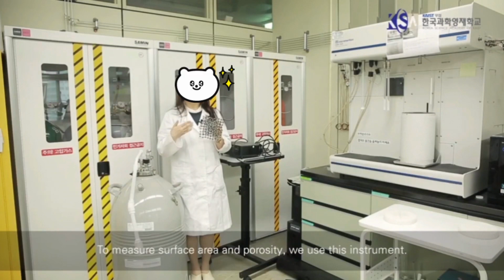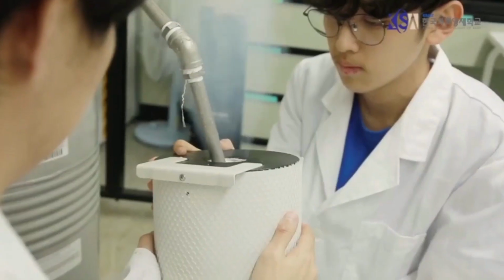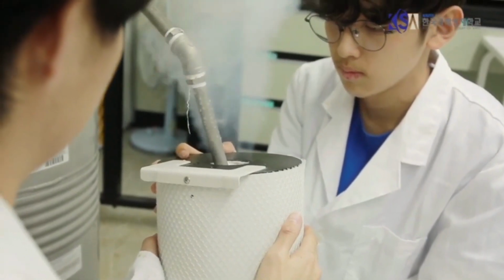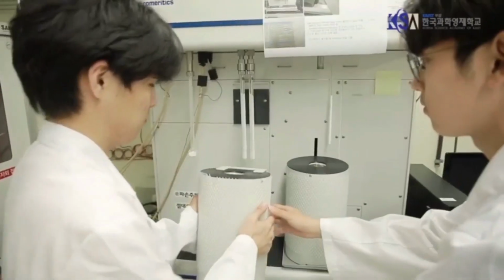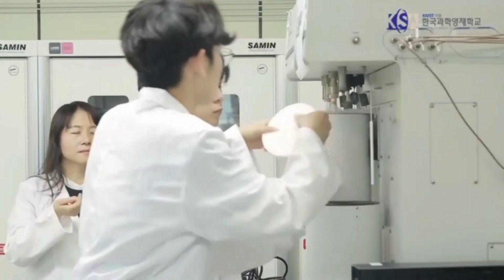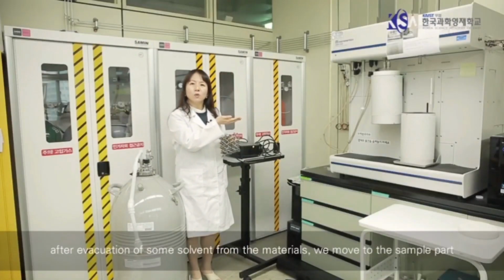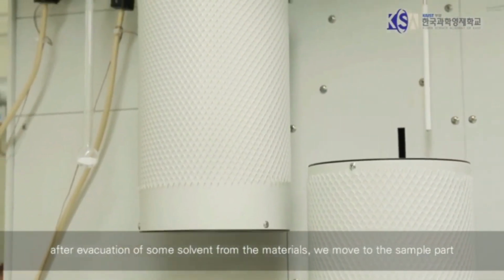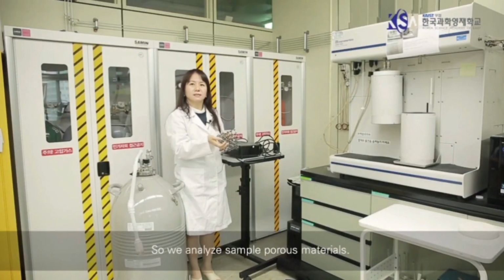So it's a metal-organic framework. To measure surface area and porosity, we use this instrument. So in the bowl, we fill the liquid nitrogen. And then we are loading it into the machine. It helps evacuating. After evacuation of solvent from the materials, we move to the sample part. So we analyze the sample porous materials.